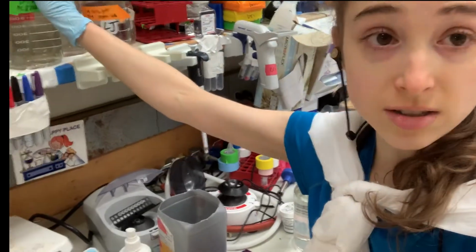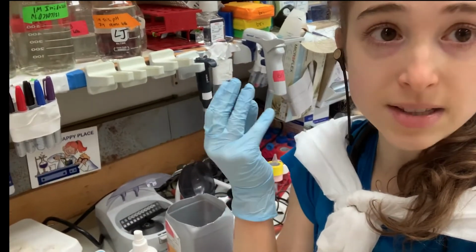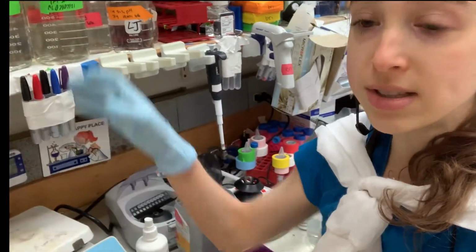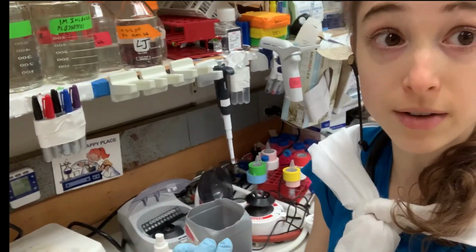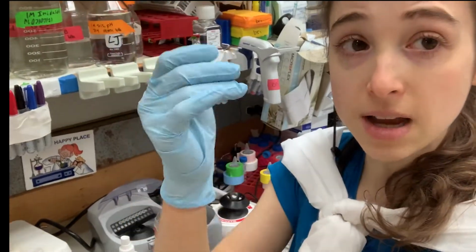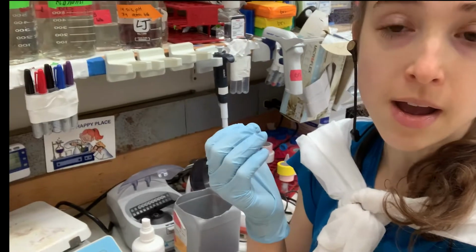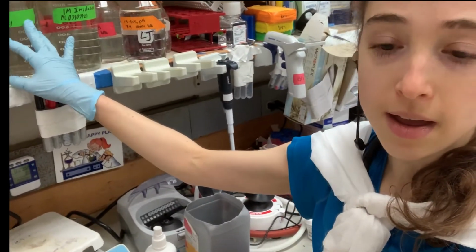Another great thing about stock solutions is typically when you have a really high concentration of something, it prevents bacteria and fungi and mold from growing, especially when, as I show you, we filter them first. And so this allows us to keep them at room temperature instead of in the cold room or in the fridge. So we can just keep them out and keep them pre-made. Whereas for dilute solutions, once you make your working solution, it's going to be more dilute. It's easier for things to grow in there. But you don't have this problem with your stock solutions.